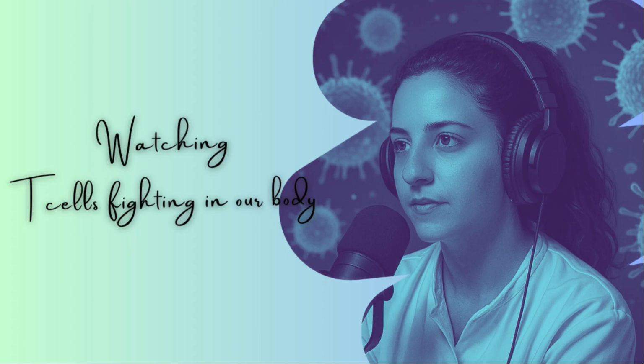Each dot you see on a flow cytometry plot means a cell. Each small dot is a cell. These dot plots show two markers at once. For example, CD4 on the x-axis and CD8 on the y-axis. You'll often see four quadrants: CD4 positive, CD8 negative, which are the helper T cells, and CD8 positive, CD4 negative, which are the cytotoxic T cells. Then there are double positive and double negative. The histograms show how strongly one marker is expressed. The further right the curve, the higher the expression. Try to imagine with me. I will try to put in a figure, if I have the exact one that explains that.